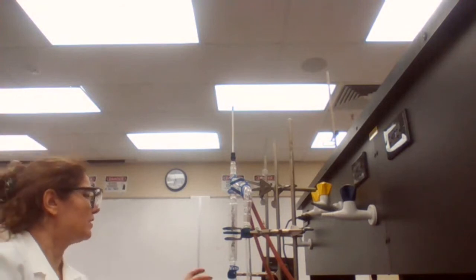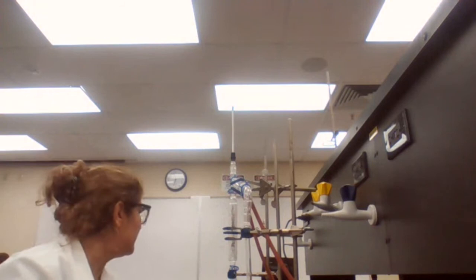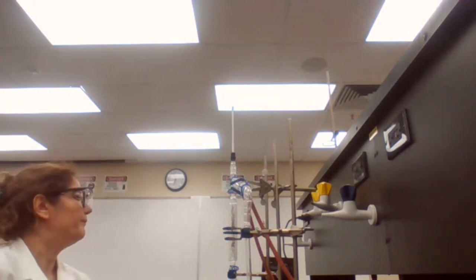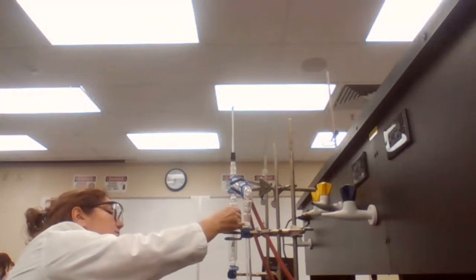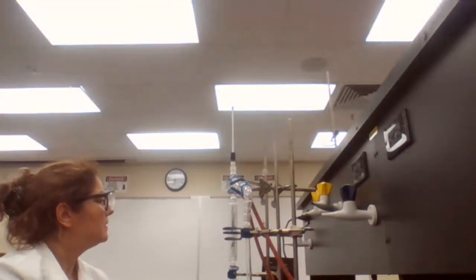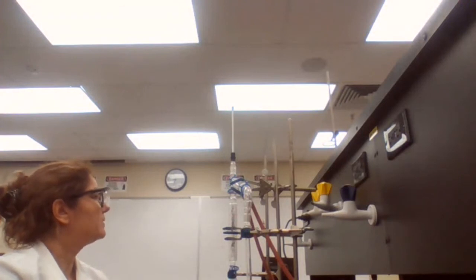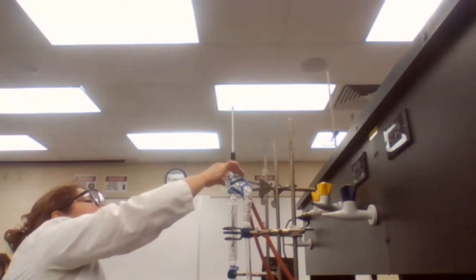Okay, the mixture starts boiling, but it would be a while before we can get any drop really down here. So we just be patient with this, we wait, and hope that we get the vapors.